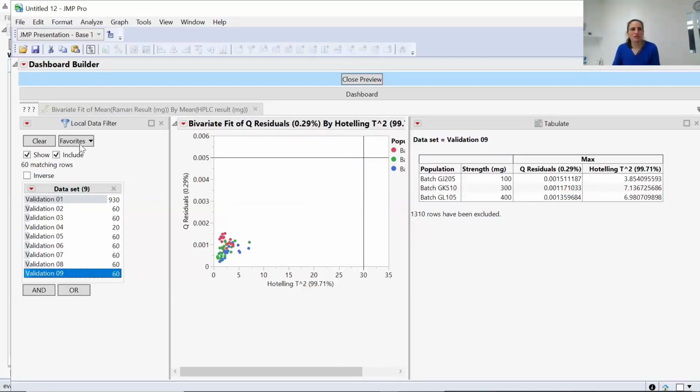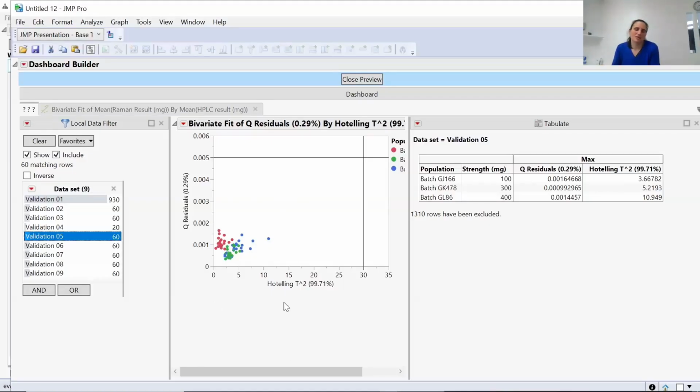Just one thing to note, if you've got multiple tabs and you're adding a filter in, it will apply to every single figure or graph that comes from that table, even if it's on a different tab. So if you leave it on one setting and you go to a different figure, you will find that you are pre-filtered. So sometimes it is better just to keep your local data filter attached to the particular tabulated data or plot. Again, you can do little things in the preview mode, even changing bits. So you can put your ID check and name things and various options in there.